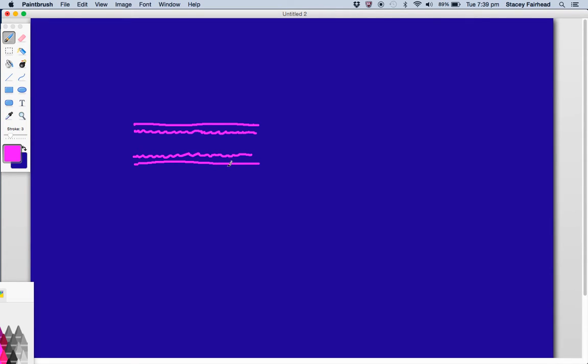Now, on the outside here, you've got the outside of the column, and then here, this is the liquid phase or the stationary phase, and that's made up of a viscous kind of liquid. The idea is that your inert gas or your mobile phase is passing through here like this, so the direction is from left to right, and I'll just mark that as helium, but any other appropriate mobile phase would also work.